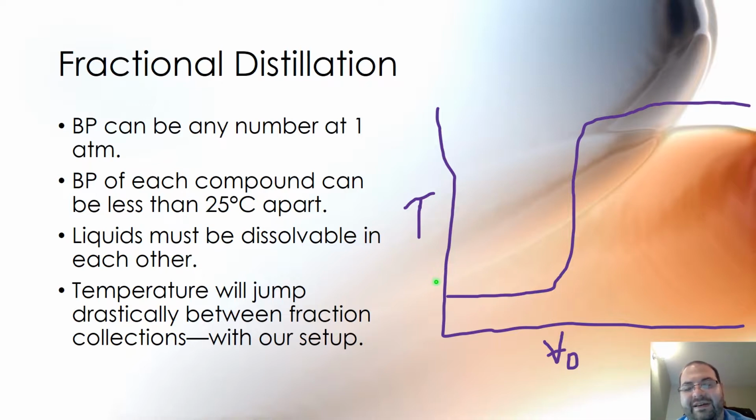There are a lot of things that go into making fractional distillation work for a process, and we won't get into too much about what makes it better or worse, but we will talk about it a little bit so you understand why it's so different, because that's important. So the first thing I'll have you do is take a look at this graph over here on the side and compare it to the other that we just saw a moment ago for simple distillation.